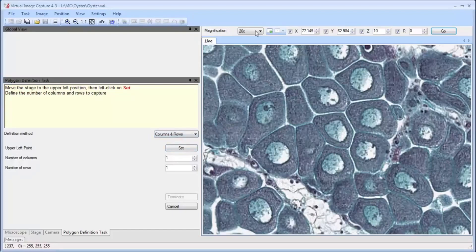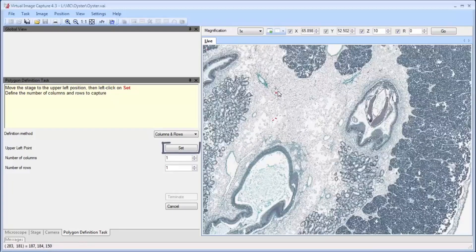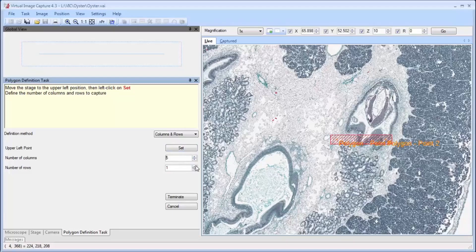After this, we select a low magnification objective, and then we will click on the upper left-hand corner of the region of interest and then select set. Following this, the number of columns and the number of rows are set.